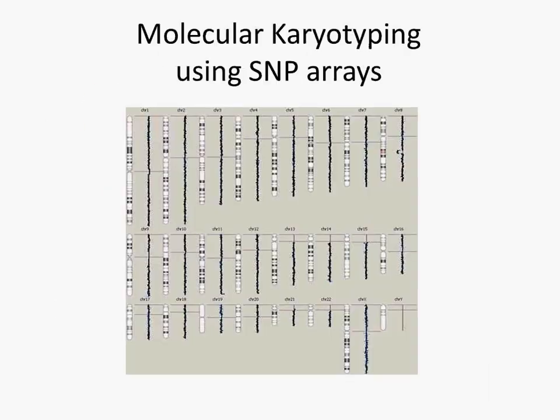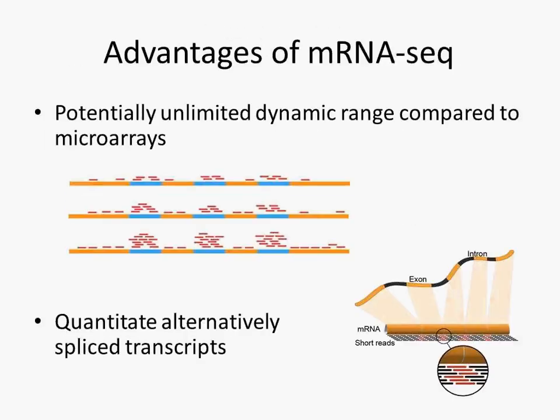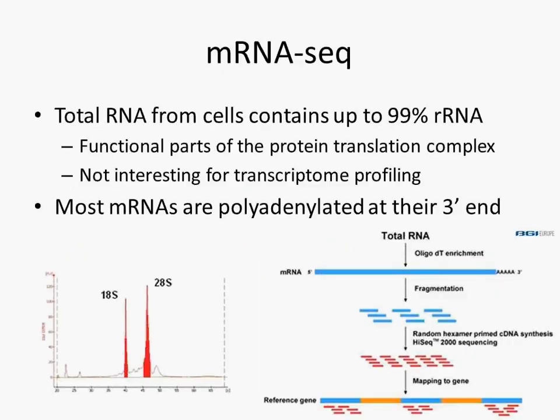So I have a question. You guys showed a protocol at the beginning of the show where you're basically enriching mRNAs using a poly-A enrichment strategy, and that's the standard protocol, right? Yes, correct. I guess some folks have thought that poly-A negative RNAs may play a minor but maybe important role in pluripotent cells. Do you guys also have a protocol where you do RNA-seq of both the poly-A enriched fraction as well as the flow-through?